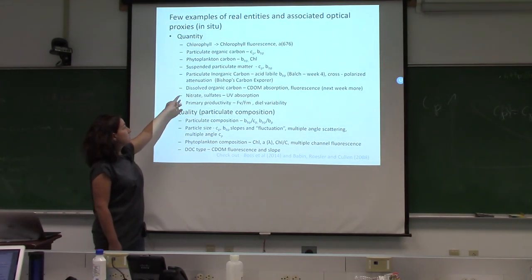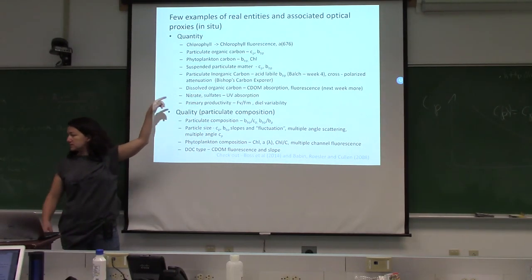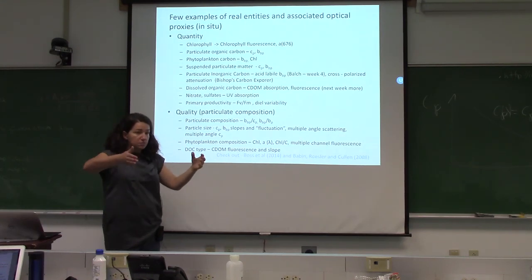You can use cross-polarized attenuation. Emmanuel mentioned it. You asked about it, I think. Is that the thing that Bishop does? He's actually taking the attenuation meter and putting a polarizer on it.